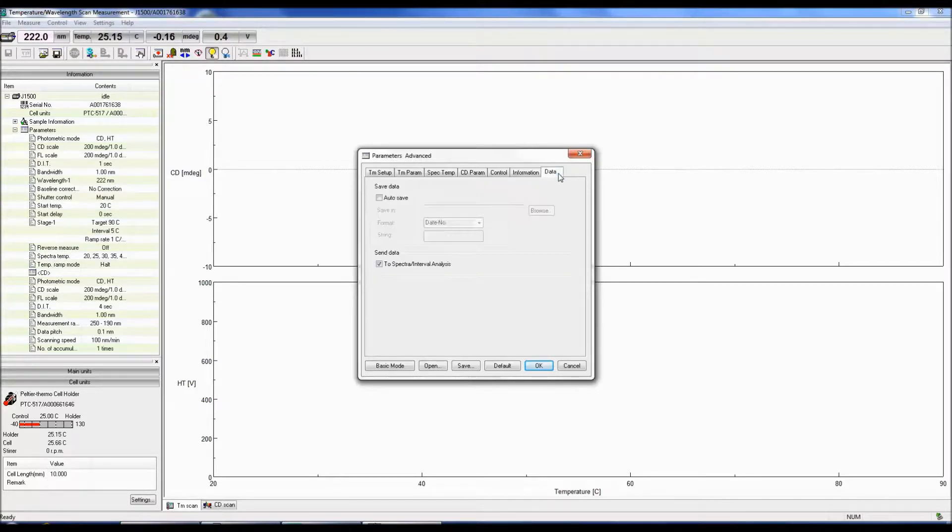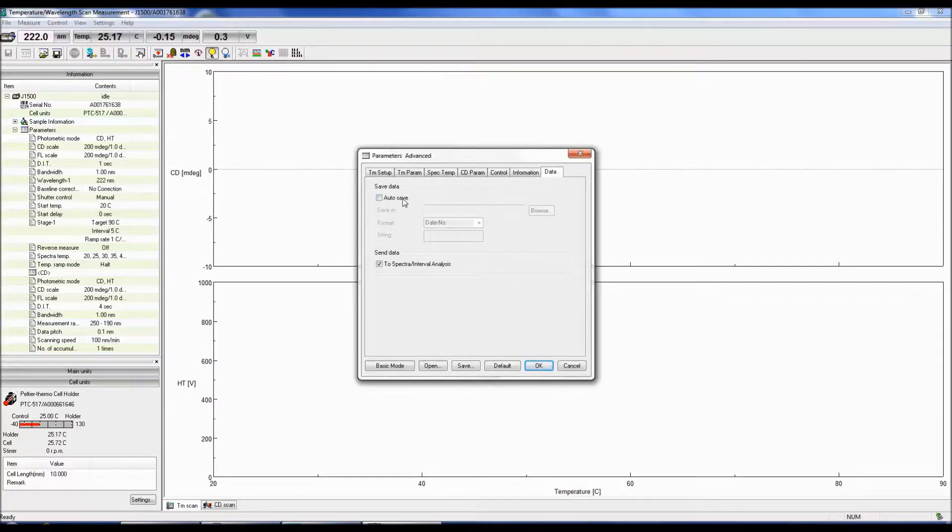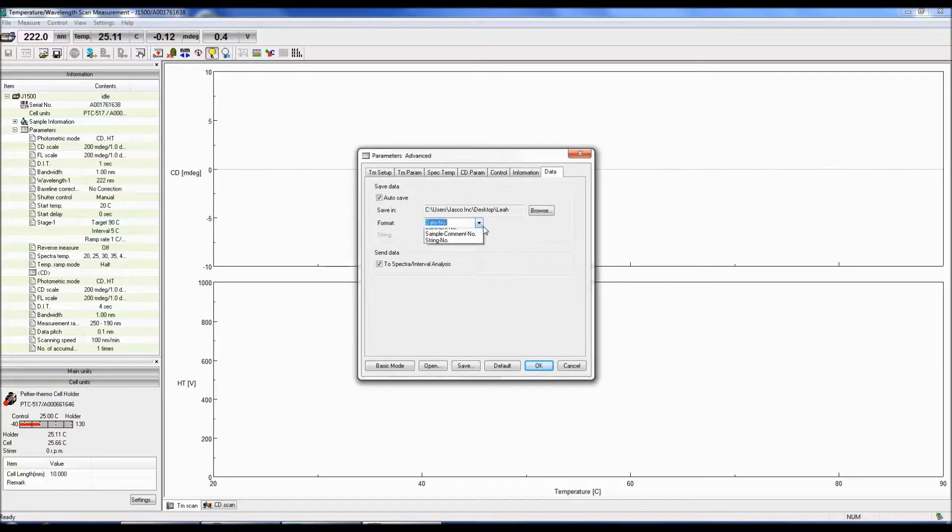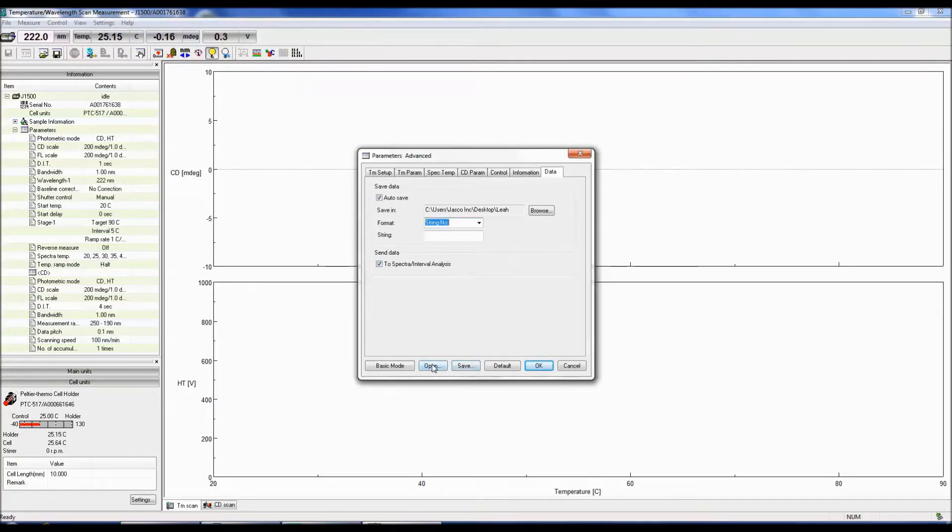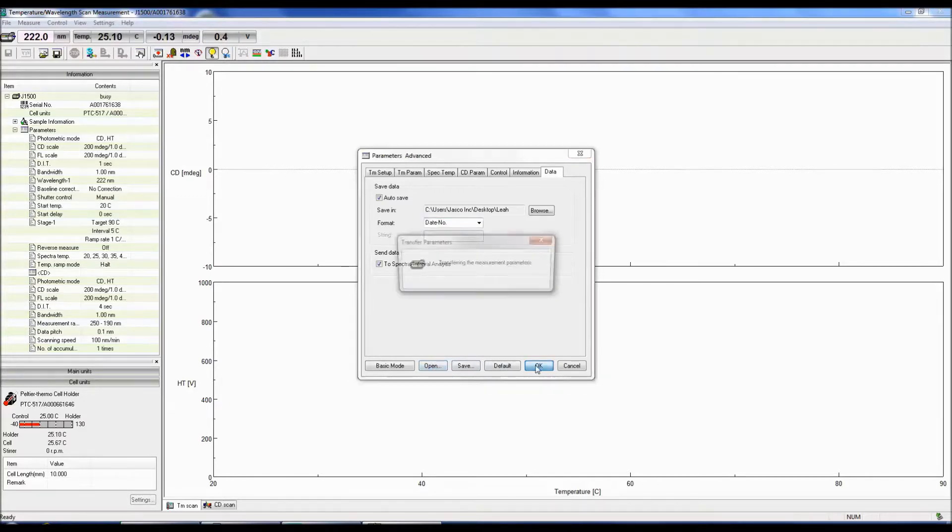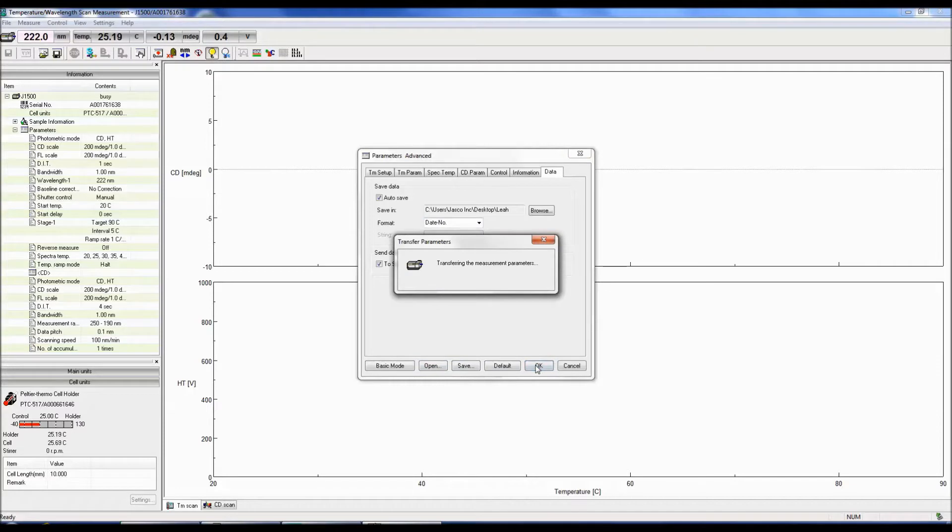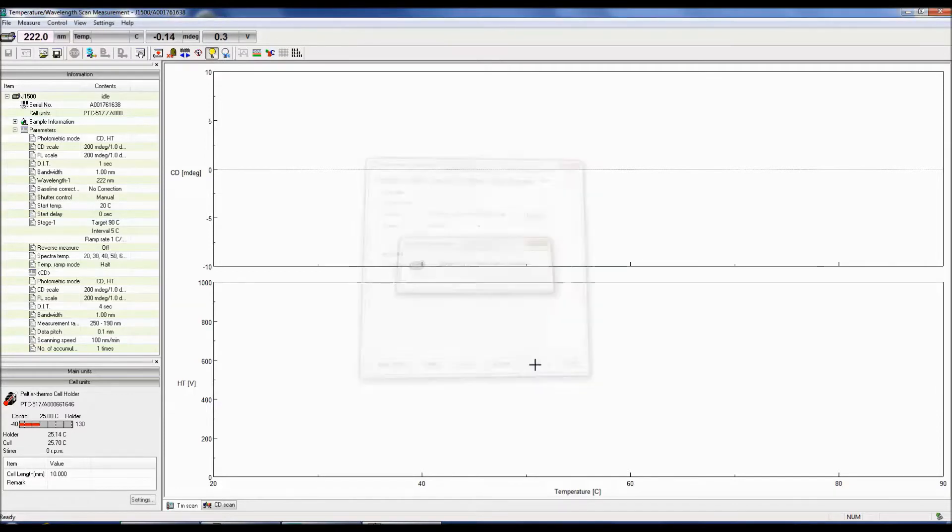The Data tab allows you to select whether to automatically save your data, as well as to specify which folder to save it to and the format the file is saved as. Saved data can be sent directly to Spectra Analysis once the measurement is finished. You can also choose to save your measurement parameters as well as open previously saved parameter files. Now select OK to save the specified measurement parameters.